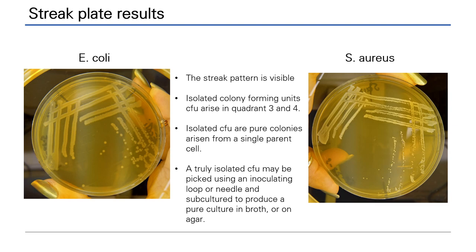Notice that on the right, the staph aureus is still producing isolated colonies, but that the colony morphology is different. The colonies are whiter in color and smaller. Isolated colonies produced in either the third or fourth quadrant are appropriate for subculture.